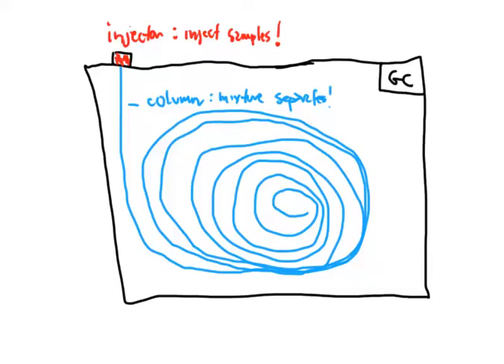Okay, well, like any tunnel, there's an entry and an outlet. So if the sample comes in one end of the column, the sample has to go out the other end of the column, right? So eventually your sample will come inside and out.